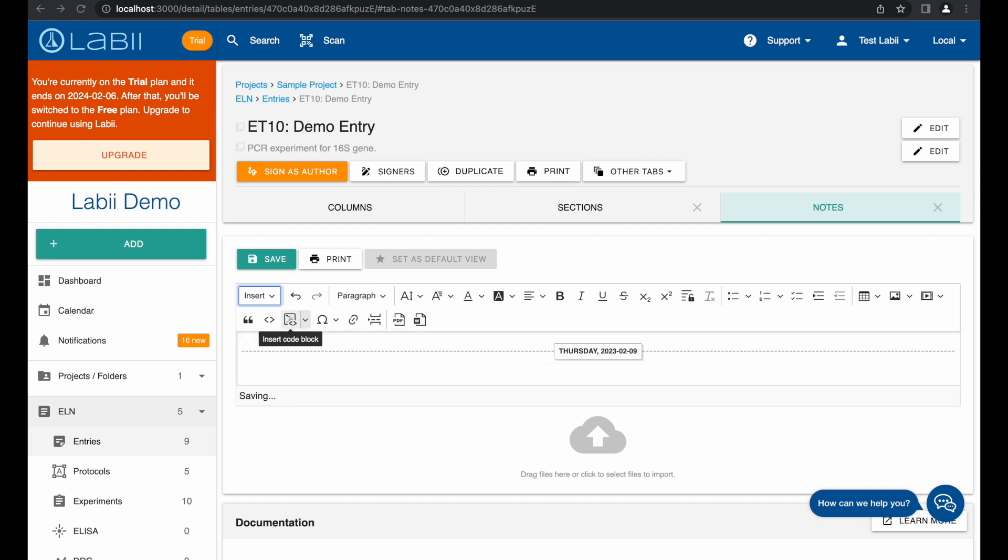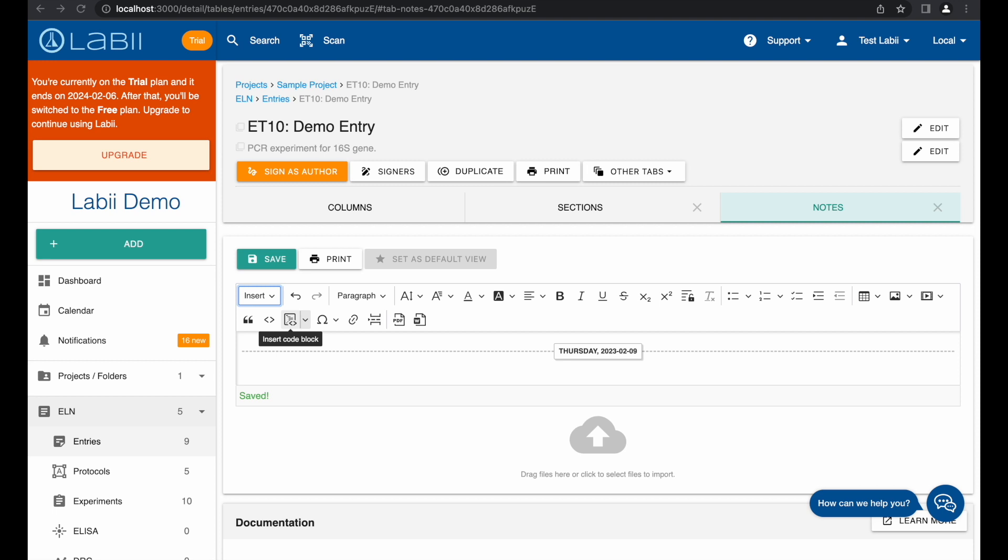Second, Labii Electronic Lab notebook offers the ability to insert text from a section or external file document, saving time and effort by eliminating the need to retype. With this feature, data can be quickly inserted into the platform in seconds, making the documentation process more efficient.